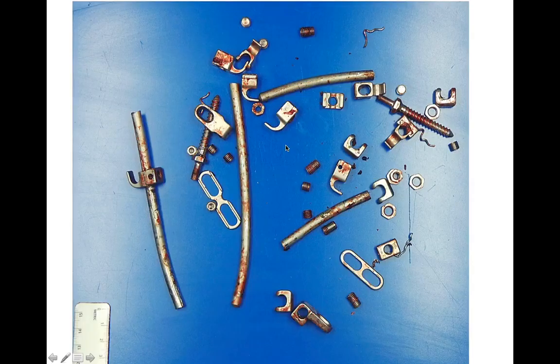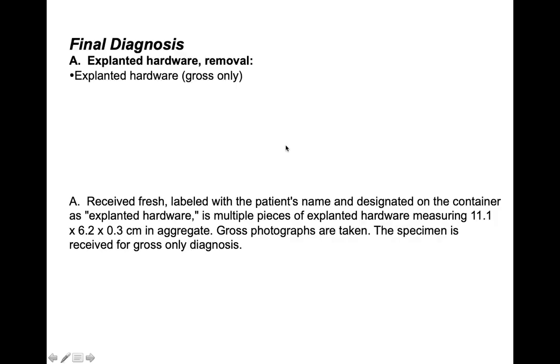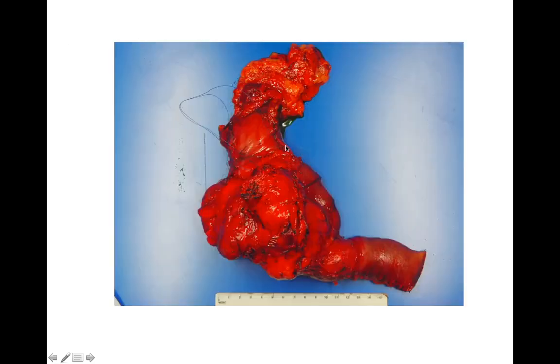Next case, we have again a bunch of hardware. You look for serial numbers, you describe it, and then you take some measurements. In this case, I don't think there were any serial numbers on this hardware, so this was just described as explanted hardware and measured in aggregate, and signed out as explanted hardware, gross only. Here we have another specimen.